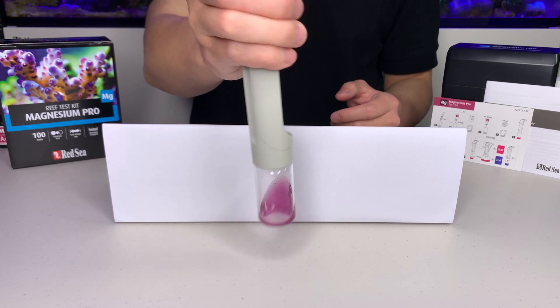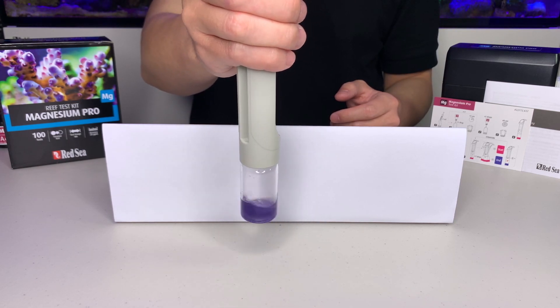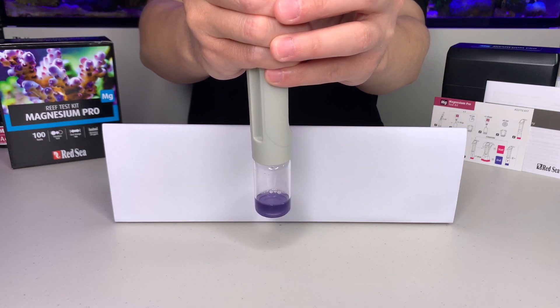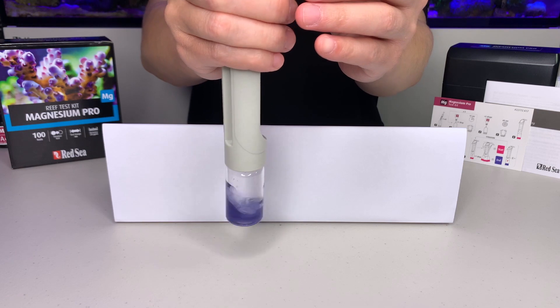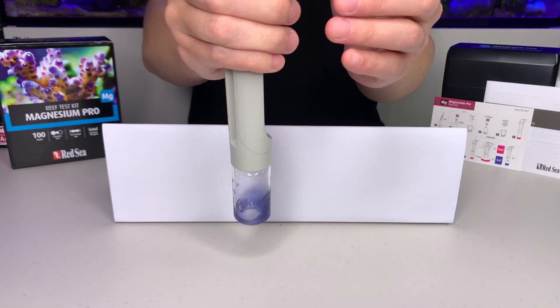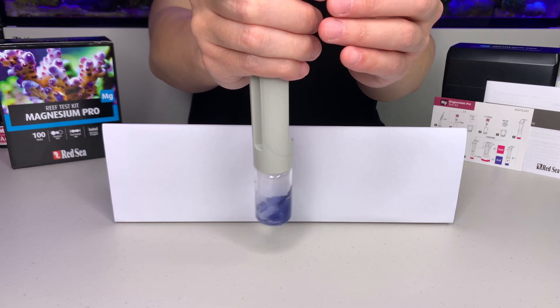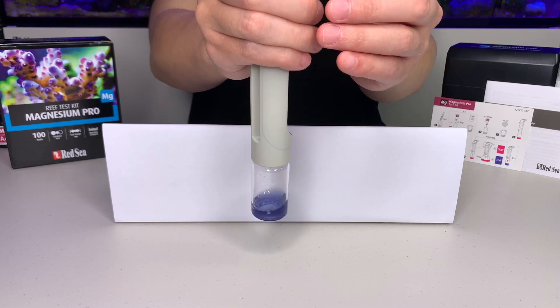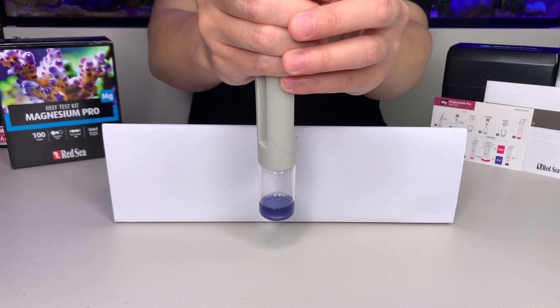Now we can see the water sample is turning to a light purple color. We will slow down the titrant adding and only add one drop at a time. Now we can see the water sample is turning to a deeper purple color, which means we are close to the endpoint. But what we are looking for is a blue color, so we continue adding the titrant into the vial.